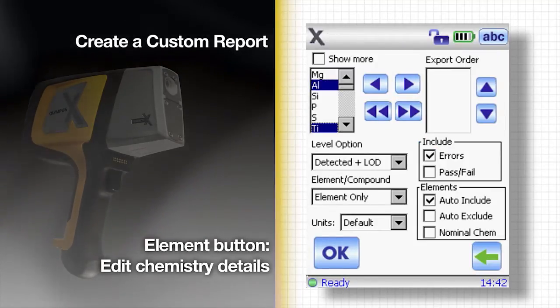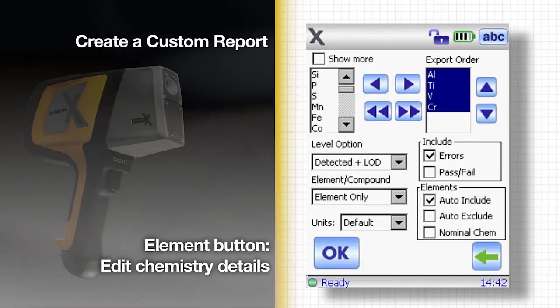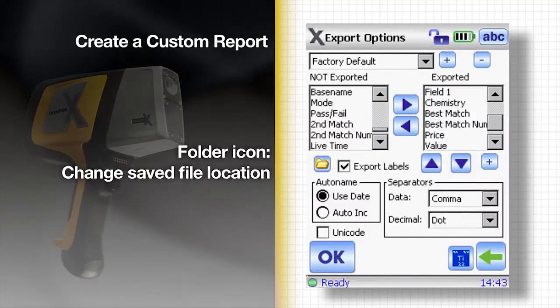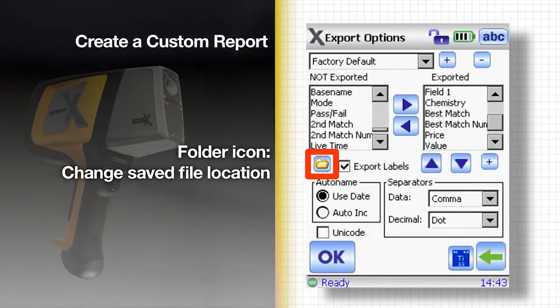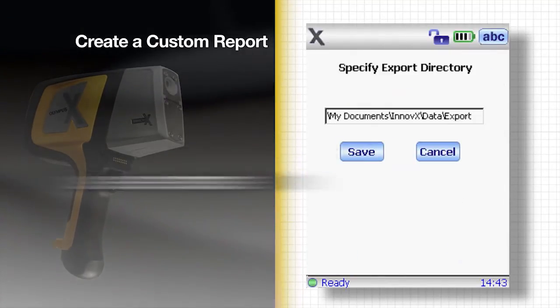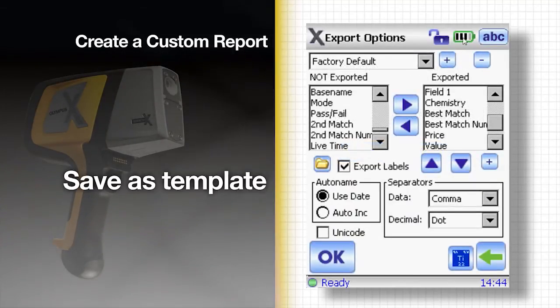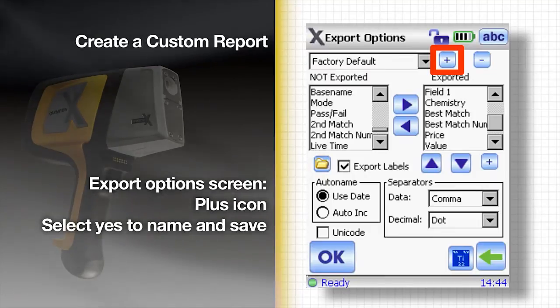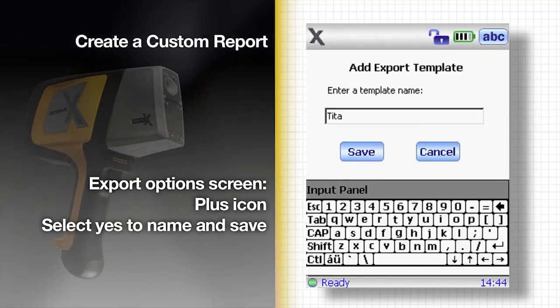Press the element button to edit the details of the chemistry section. Elements can be added or removed from the report just like other columns. To change the location of the saved file, select the export destination by tapping the folder icon. Now that we have changed some settings, we can save this as a template. Tap the plus icon at the top of the export options page, then select yes to save and name your template.